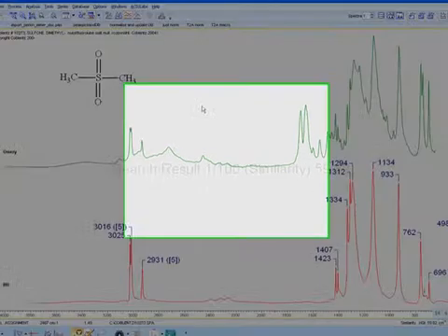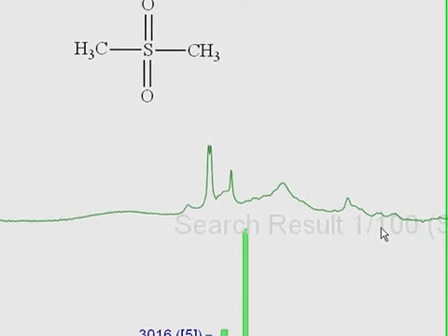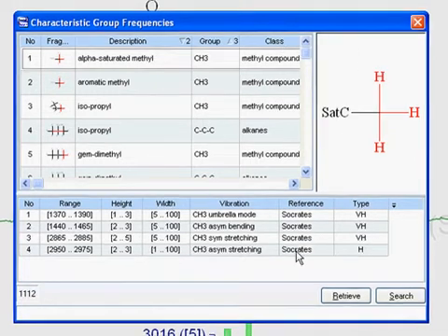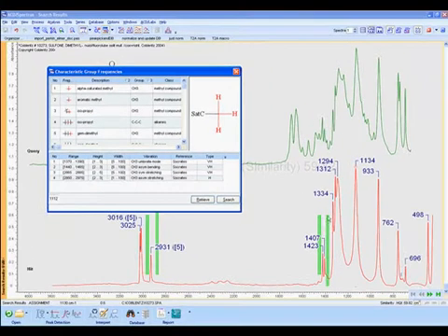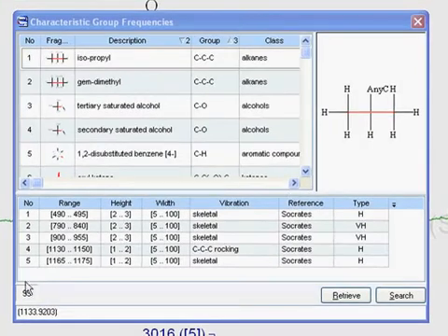We can also browse the knowledge base. Right-click on the work area and select Knowledge. This window will provide a list of all the fragments that are contained. One can search manually or click on a peak, and results will be filtered to fragments that could best match.